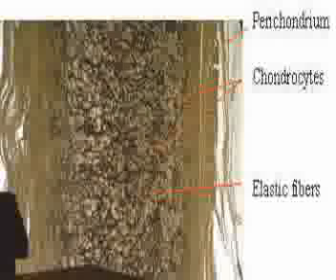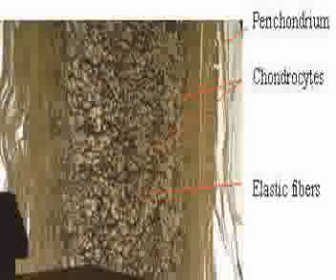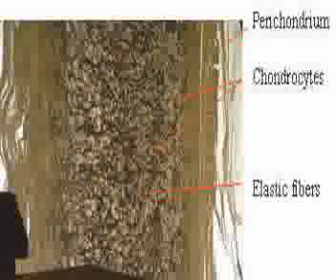Yellow elastic cartilage is made up of chondrocytes surrounded by elastic fibers which take dark stain with silver salts. They are found in the epiglottis.